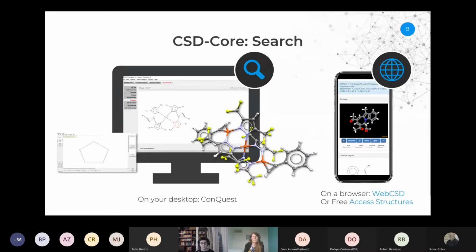So today we're going to be using ConQuest. I think you should all have information sent to you via email about how you can install ConQuest, and you should all have a 1-month workshop license so you can use it. So if you have got it installed, you should be able to see this icon on your desktop.